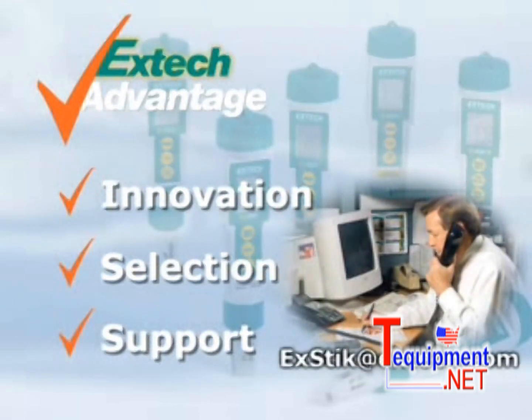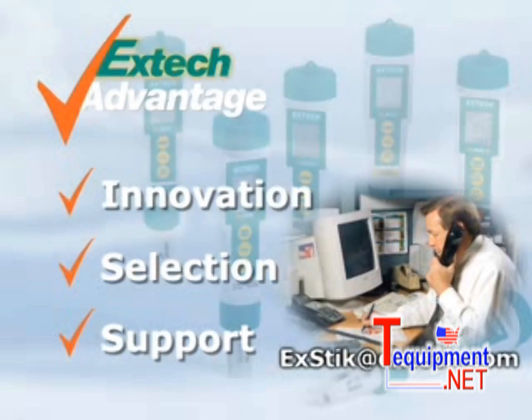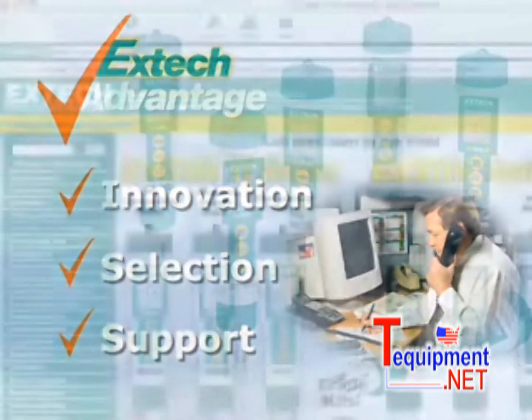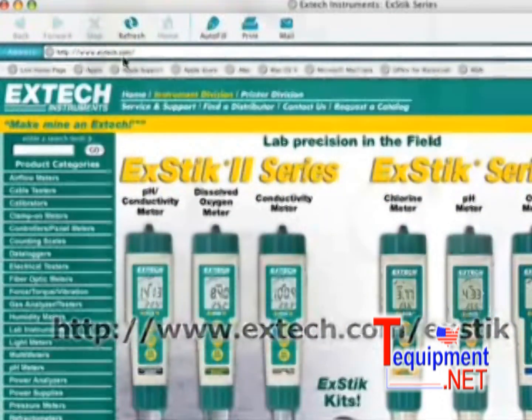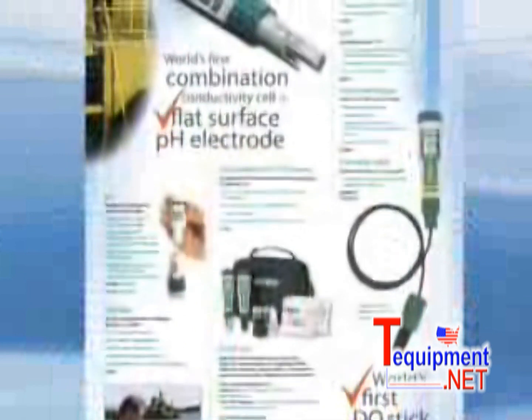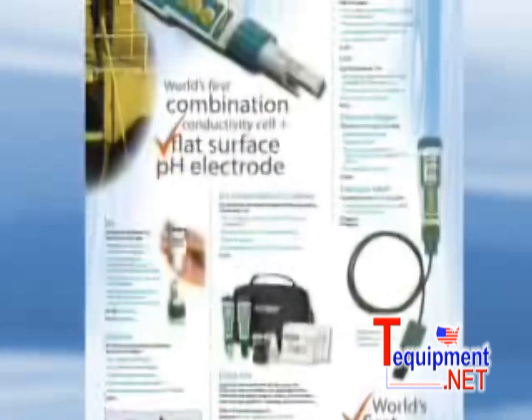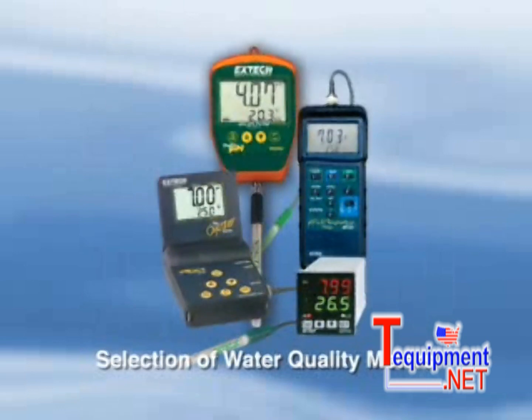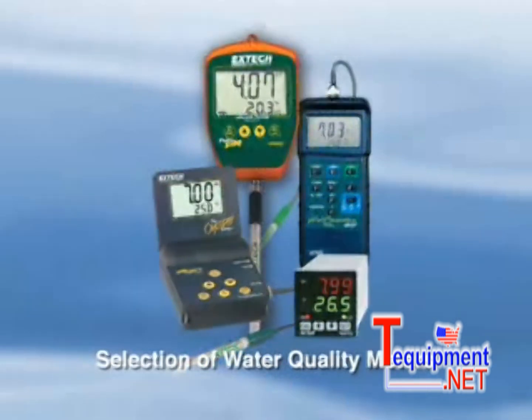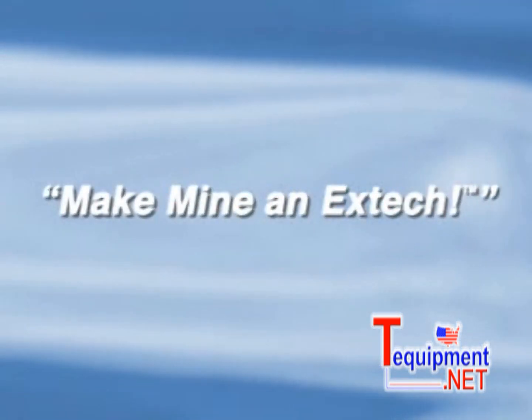When you have any questions, email us at extech@extech.com. For more information on this and the other models in the Extech series, please log on to our website at www.extech.com and request our latest Extech brochure. You'll also find that Extech offers other types of lab and water quality testing meters. So remember, the next time you're looking for a dissolved oxygen meter, we want you to see Extech.